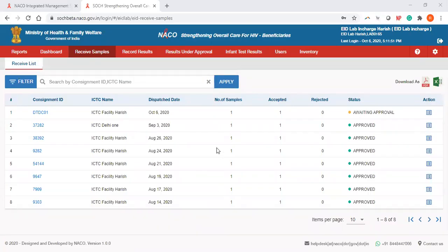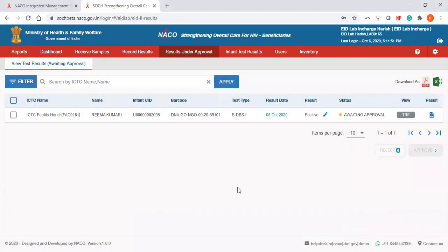This video is for the EID Lab in Charge module. The task of the EID Lab in Charge is to have an overview of all activities going on in the EID Lab and the results under approval tab, which will allow the EID Lab in Charge to approve test results that are updated by the lab technician.